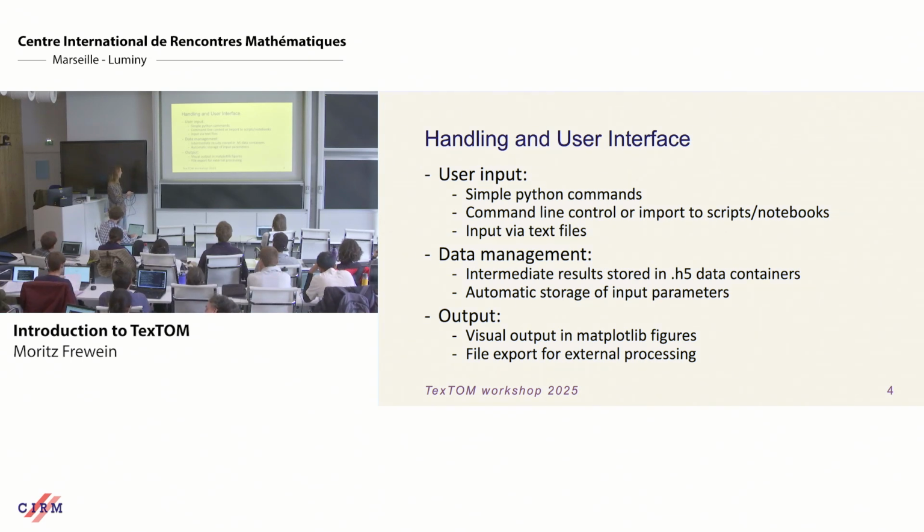And then I try to store any input parameters so you have a good documentation throughout the reconstruction. There's some visual output within the software, but we also have some exports where you can then do, for example, some segmenting in some other software, whatever you want.